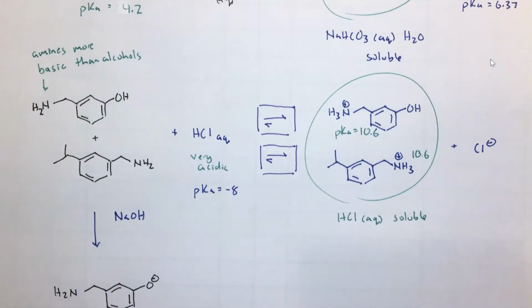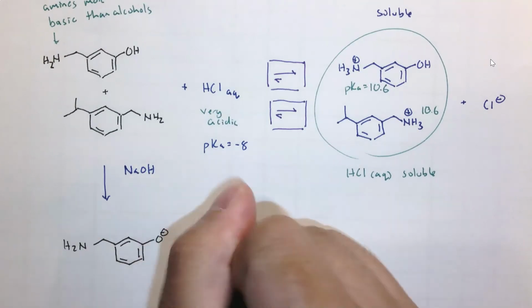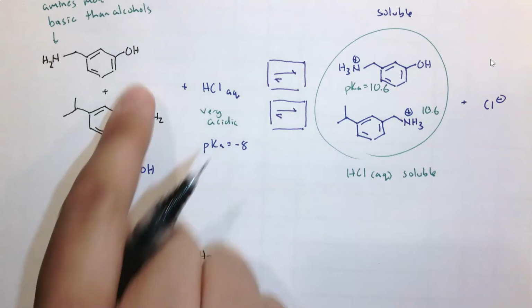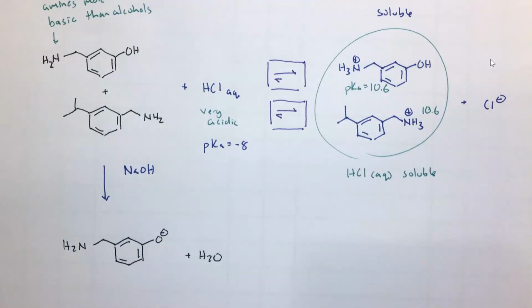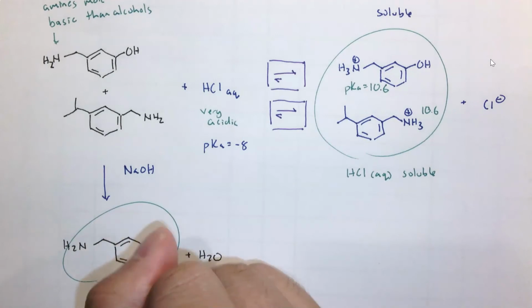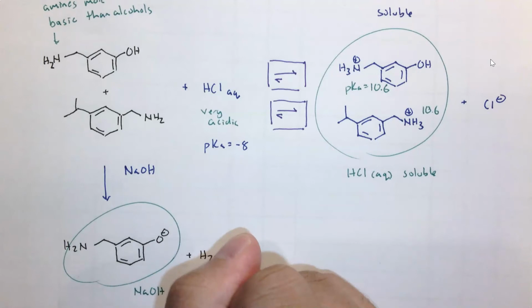And when we do the pKa analysis, you have water, right? What was this, 15.7, versus this one, which is 10.0. Okay, so this is the weaker acid. And we get this to go into the NaOH aqueous phase.